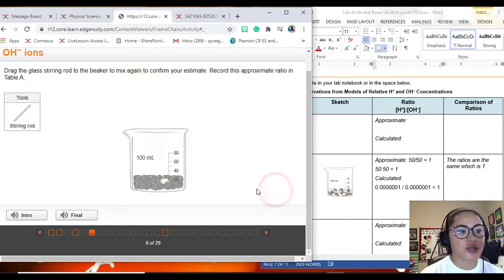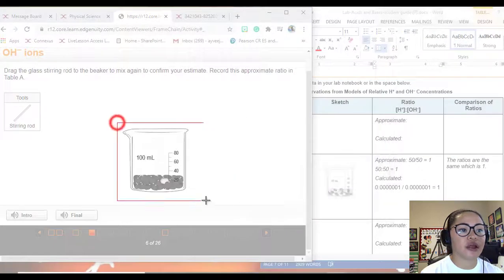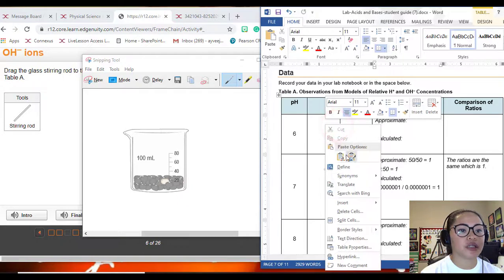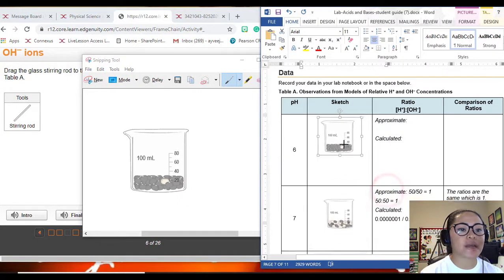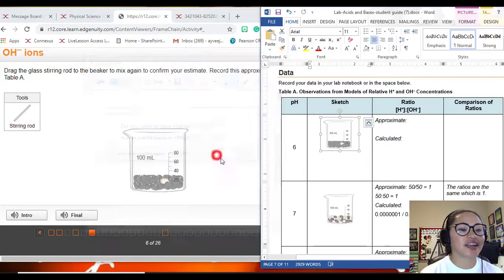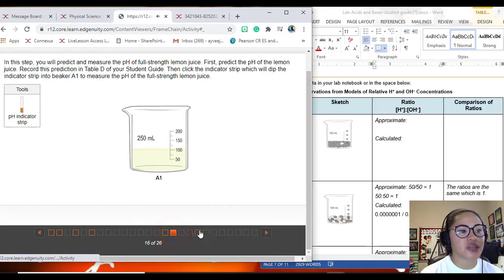And then click continue. And so do not forget, go get your snipping tool again and then crop that one, do the same thing and put it here. Okay, so I think that is making your life easier. All right, so now next thing is you are going to get your ratio.